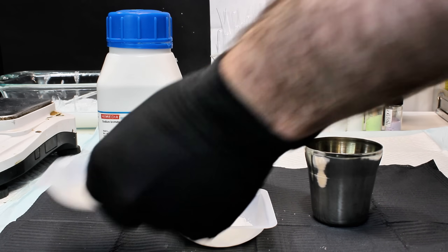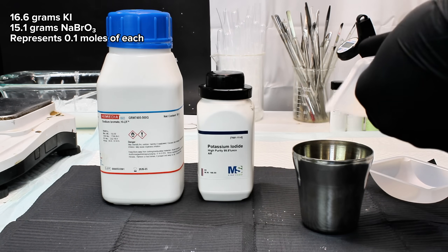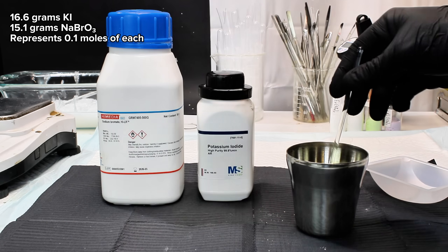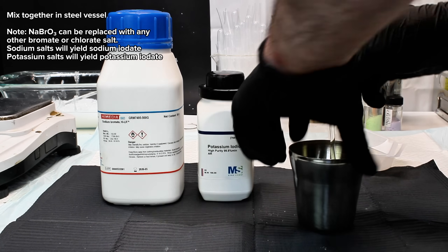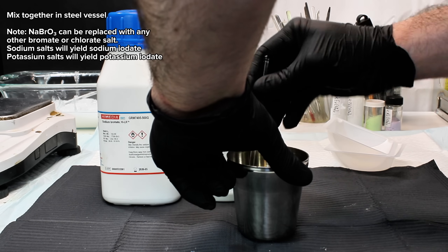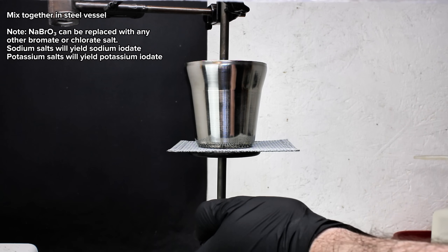To get started, I first mixed together 16.6 grams of potassium iodide and 15.1 grams of sodium bromate in a stainless steel vessel. This represents a tenth of a mole of each salt, and the sodium bromate can be substituted with the sodium or potassium salts of either bromate or chlorate, as long as the proper adjustments are made to account for the differences in molar mass.